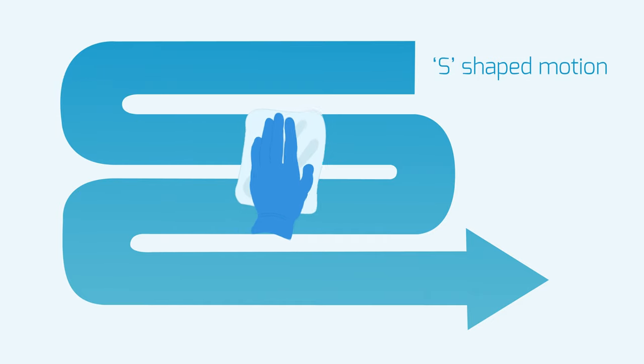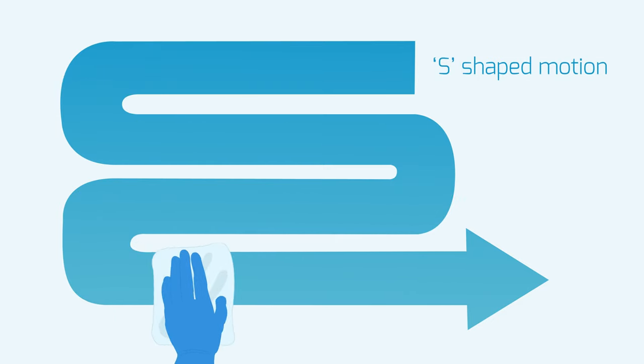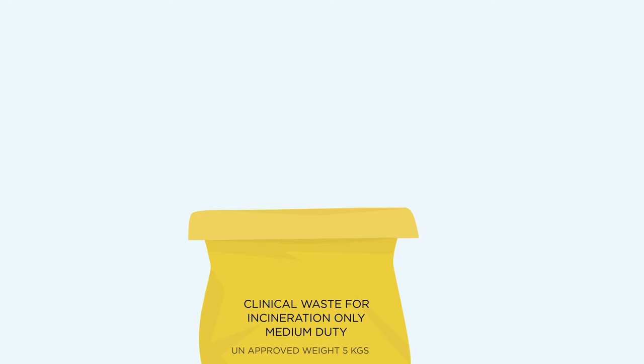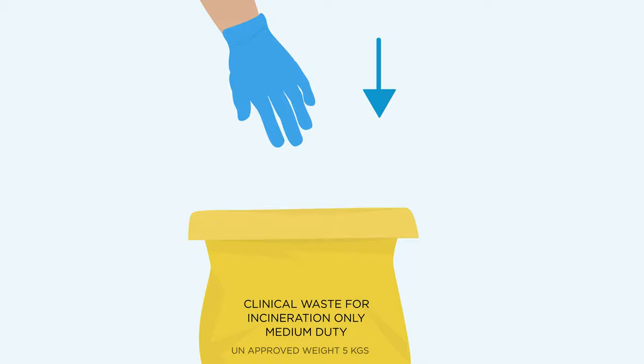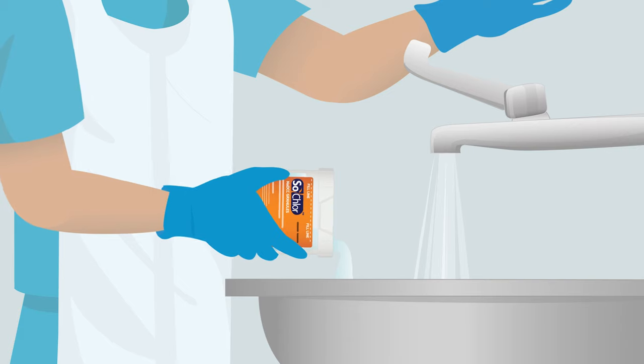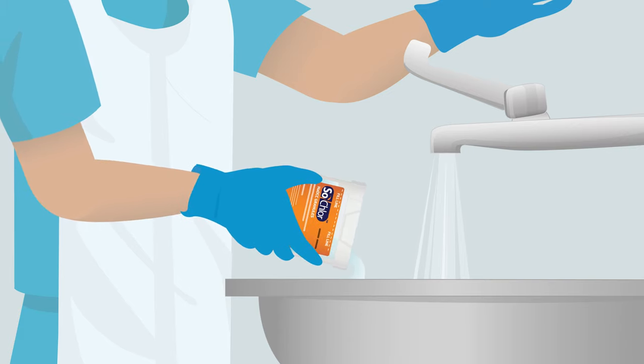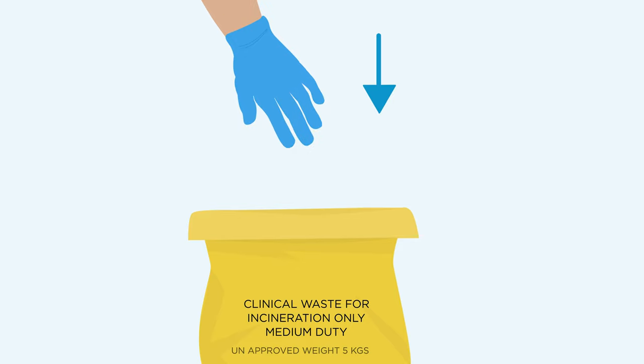Use the wetted paper towels to wipe the spill area and any splashes, always wiping in an s-shape motion. Dispose of used paper towels in the bag provided. Pour remaining solution down sluice or sink with running water. Be careful not to contaminate handles with gloves. Then put the empty container in the yellow waste bag provided.